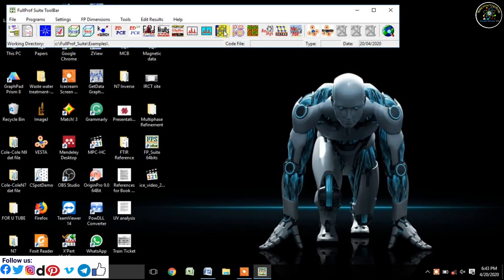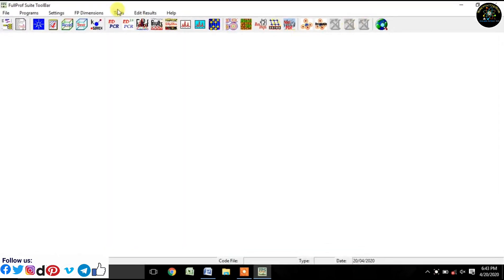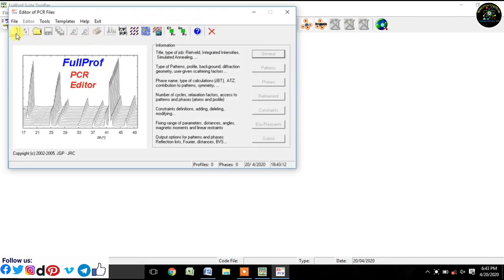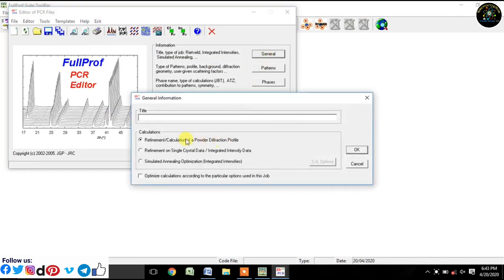Just follow every step precisely and carefully.